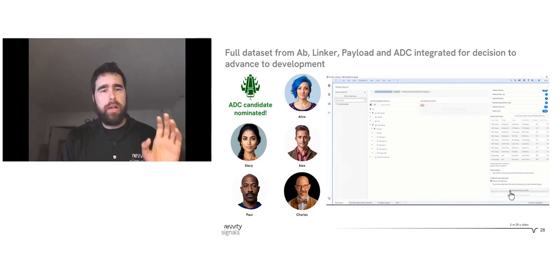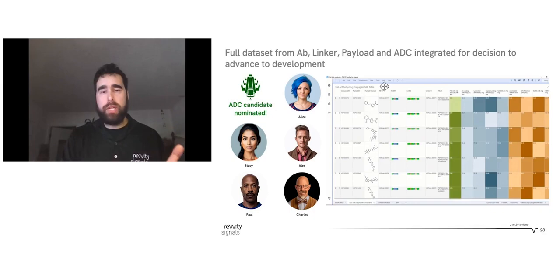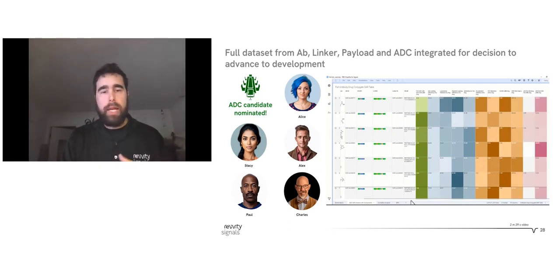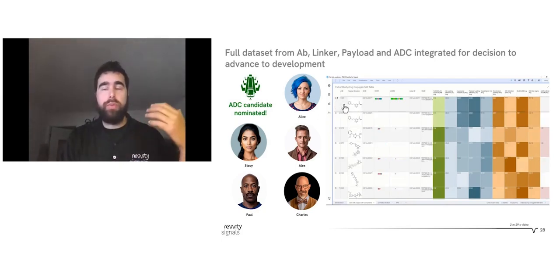Pause for a second. So the green will be the final antibody-drug conjugate information or test results. The blue is the linker results for all the things like antibody load efficiency. The tan are the results related to the antibody itself. And the pink is related to the small molecule payload, which we'll show you in just a second. Think for a moment about what we're doing. All those results are being pulled together, really disparate constituents, all part of a final single construct, being assembled into a single dashboard that will, as I open it every time, be refreshed with the correct data.